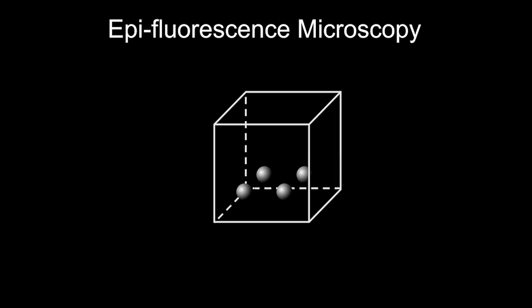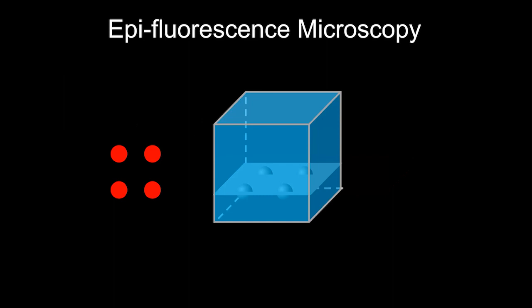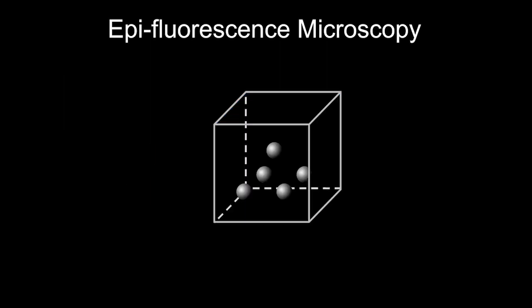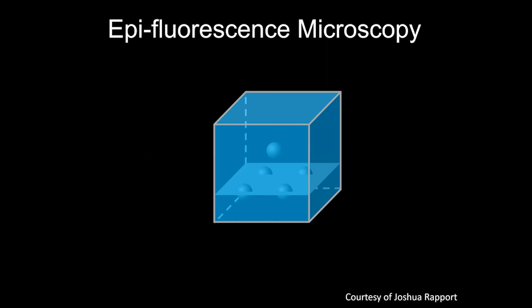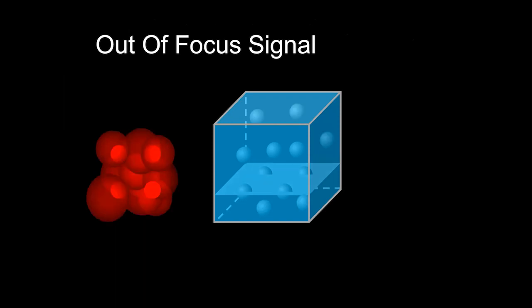Epifluorescence works great when all your fluorophores are in a flat single plane — four fluorophores close to the coverslip give you nice, sharp, crisp spots. But most biological samples don't behave like this. You often have fluorophores outside the focal plane, and when you focus on your plane of interest you get light from those out-of-focus fluorophores, creating a haze in your final image.